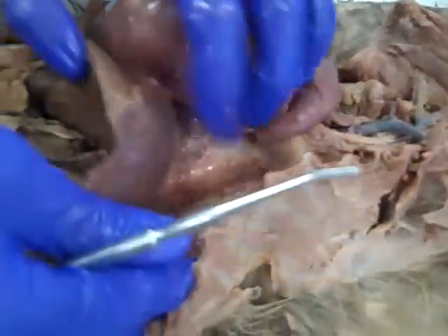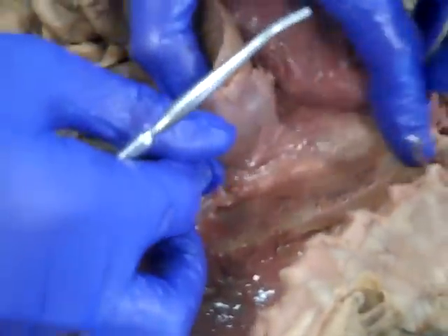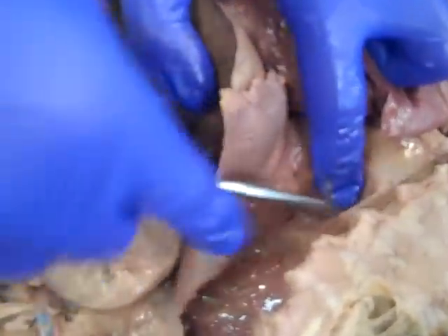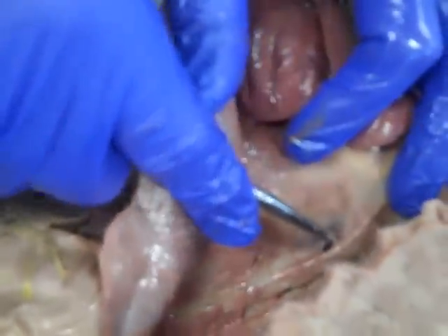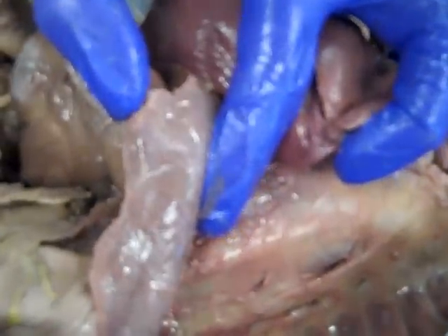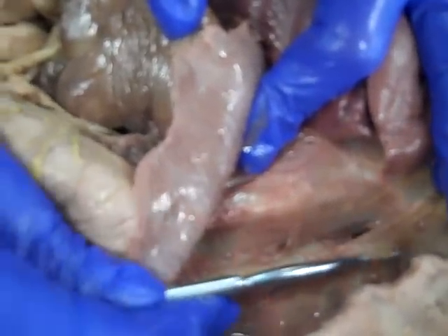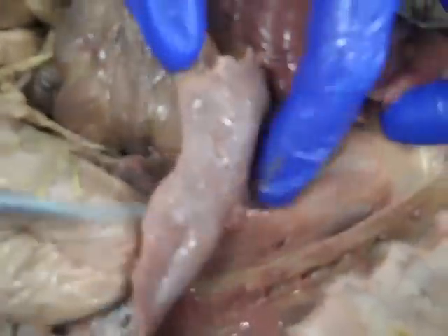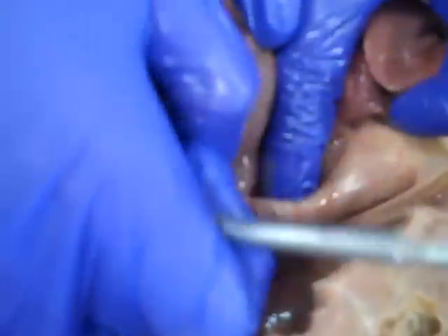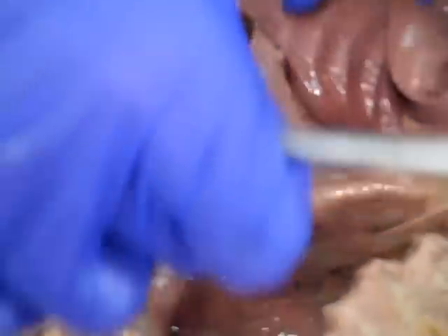Let's pull our left lung aside a little bit. And when I do that, we can totally see the outline of the thoracic aorta. I can get the probe underneath the aorta right there. And as I do this, not only do I see that aorta, but I also see little intercostal arteries coming off of it. Little tiny intercostal arteries right there, which is cool. And I can see my esophagus right here. I can grab my esophagus and squeeze it.